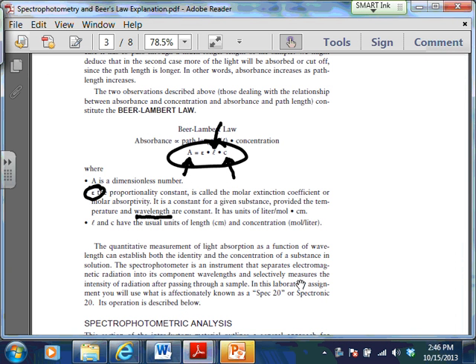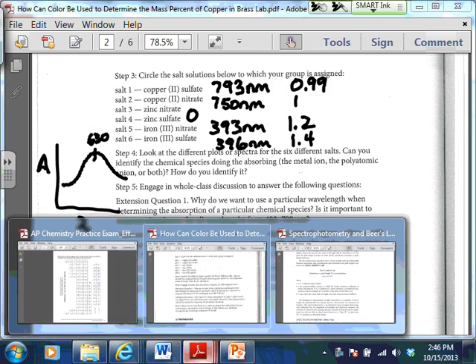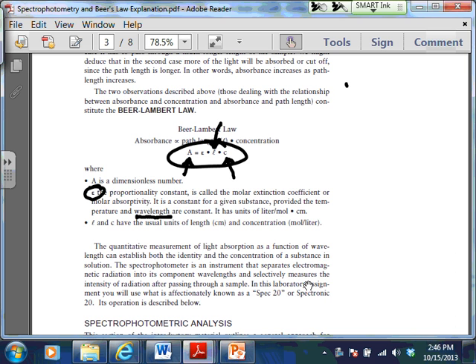So basically, here's our strategy for tomorrow. With Beer's law, instead of having to find the proportionality constant, which is kind of a pain, what we can do is change the concentration of a known and measure concentration versus the absorbance. I'll put concentration in brackets to make it a little more obvious.